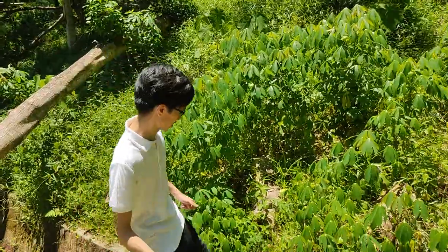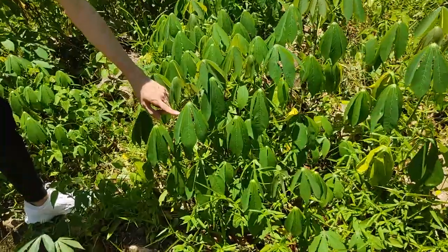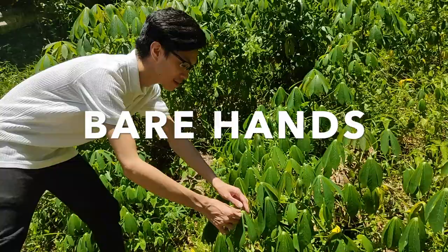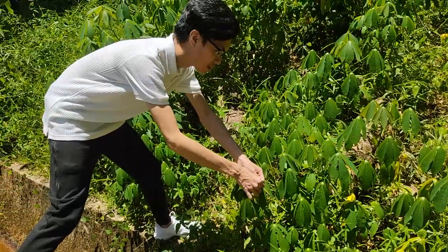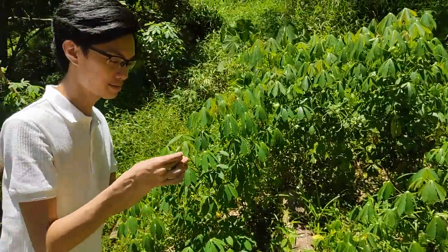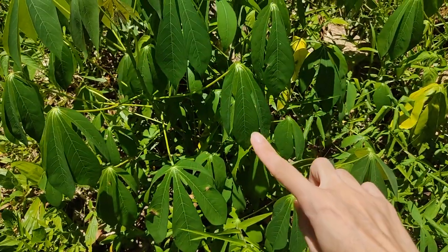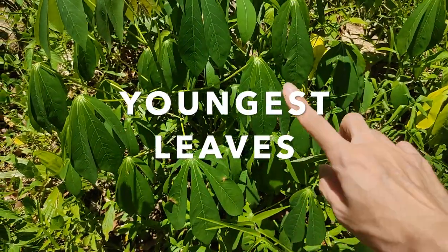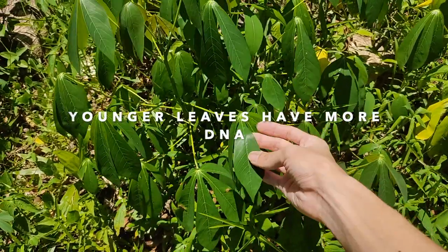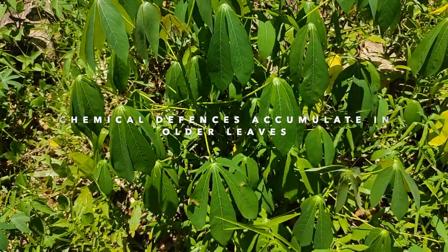Our plant sampling will begin with Protocol 1. This protocol does not require any tools or materials — all we need is our hands. Simply pluck the leaf and place it in a small container. Remember to always choose the youngest leaf for plant sampling and DNA extraction, as young leaves have more DNA than older leaves.